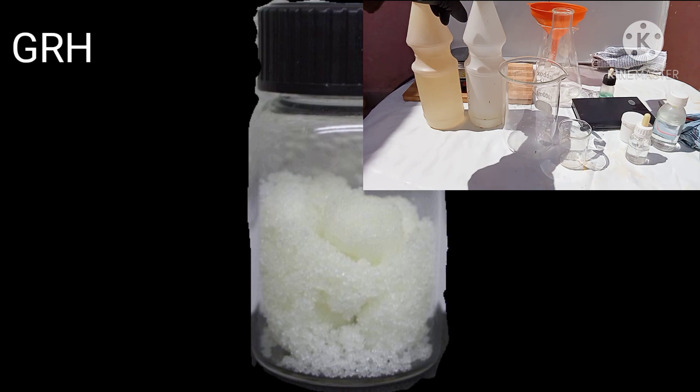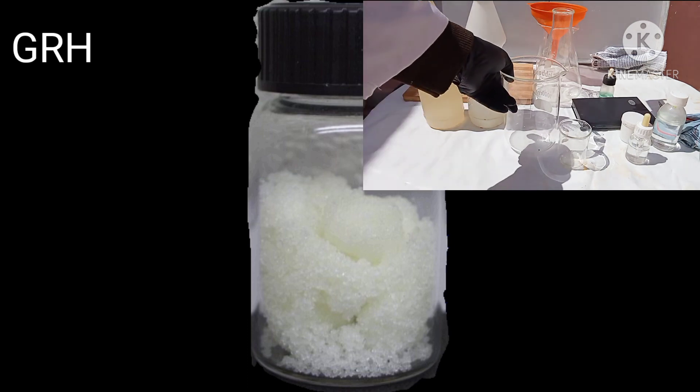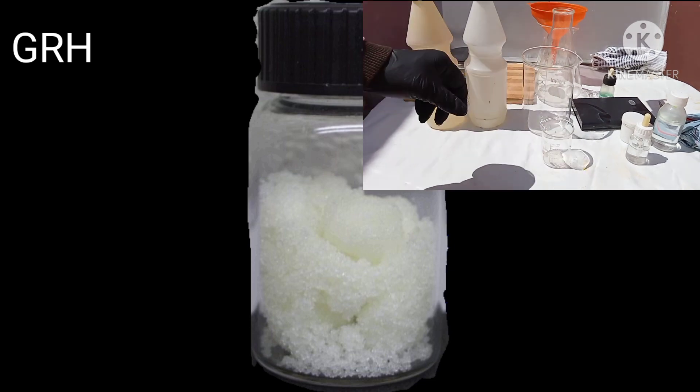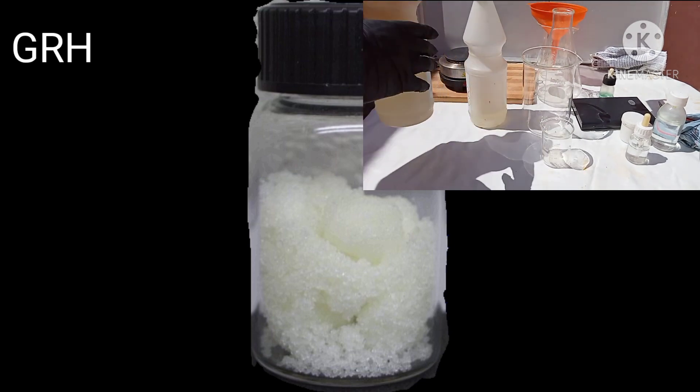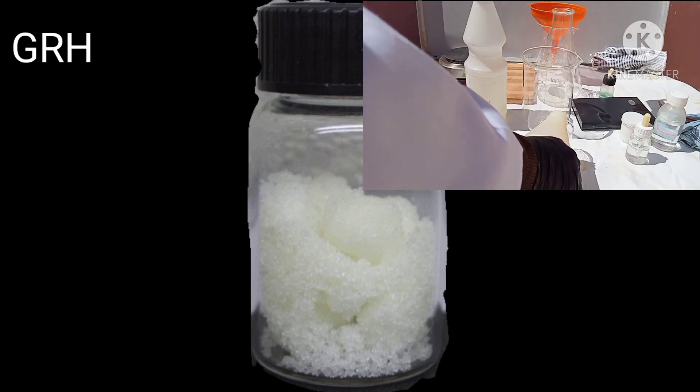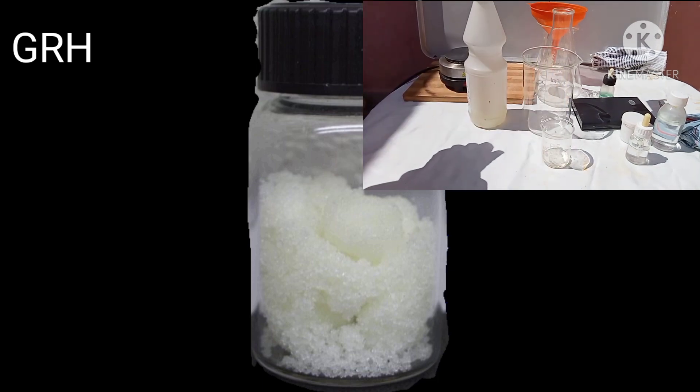You will have the usual problems if you do not expel all of the nitric acid. When using sodium nitrite, you want your solution to contain no more than 5% acid. If gold fails to precipitate, dilute the solution and/or add pinches of sodium bicarbonate to neutralize some of the acid.